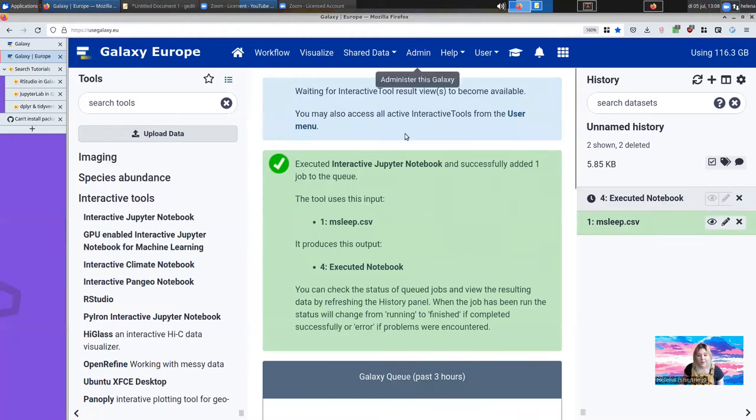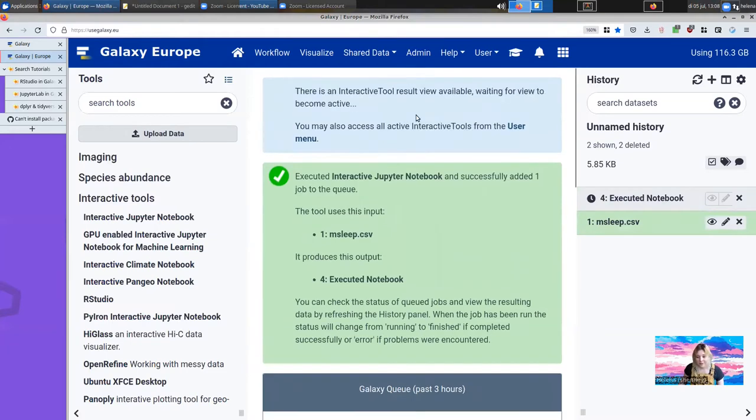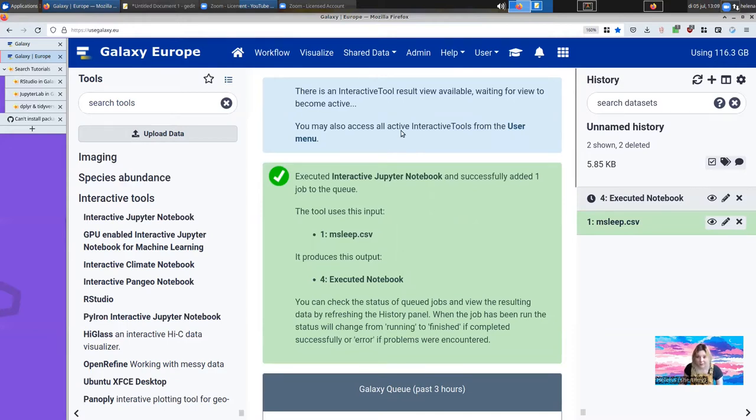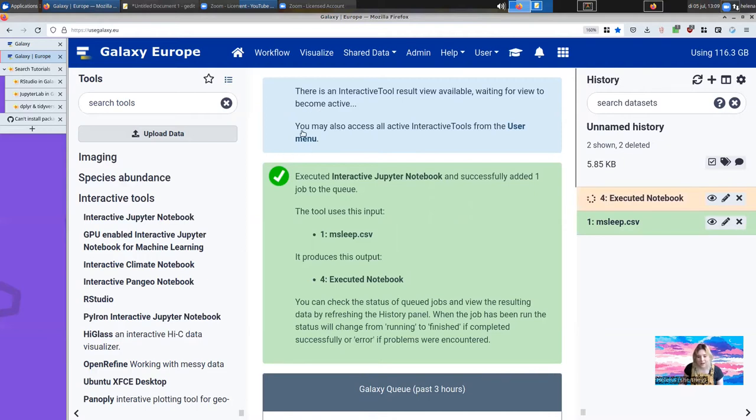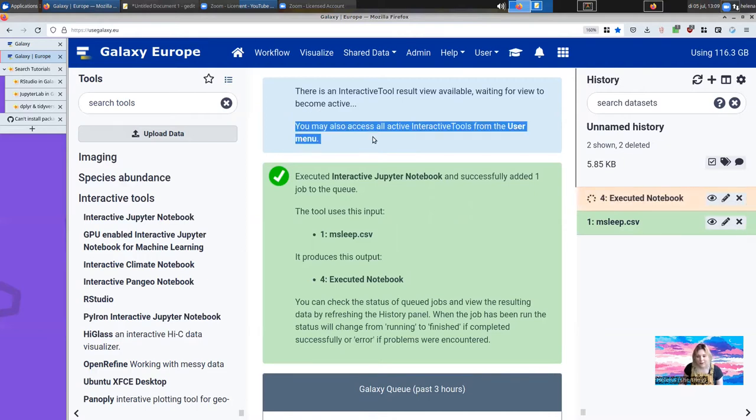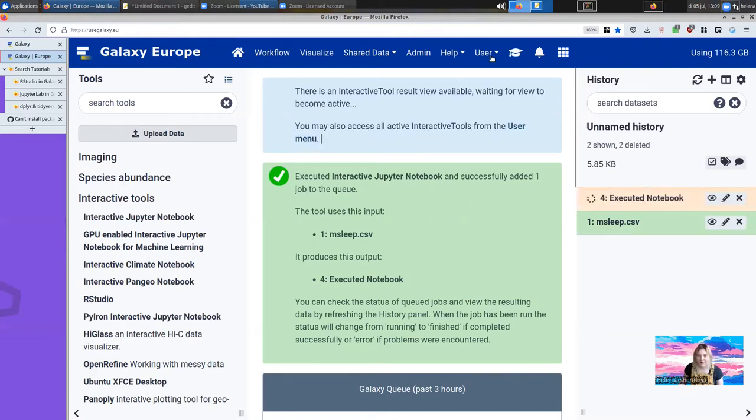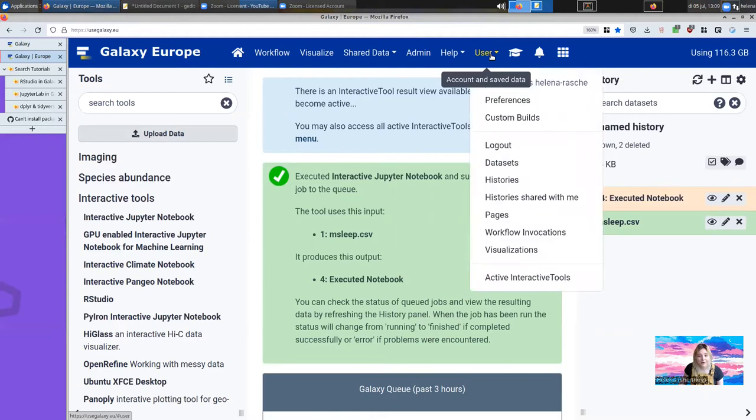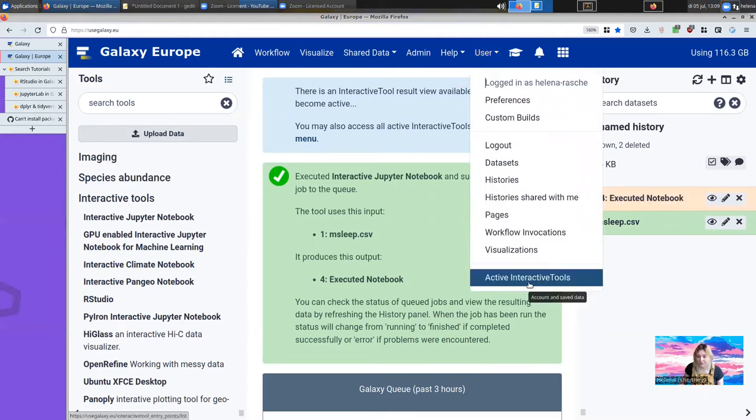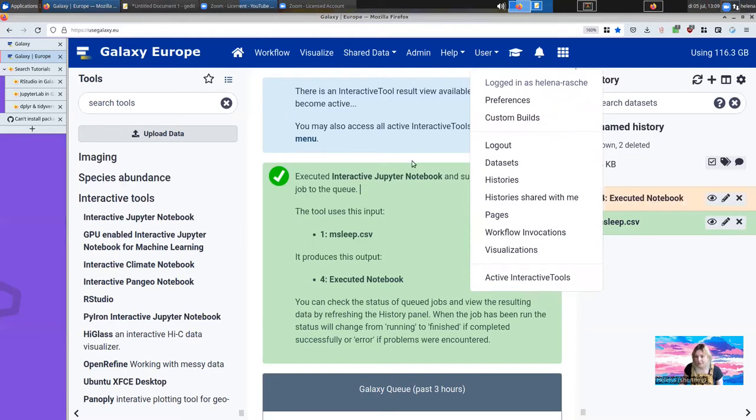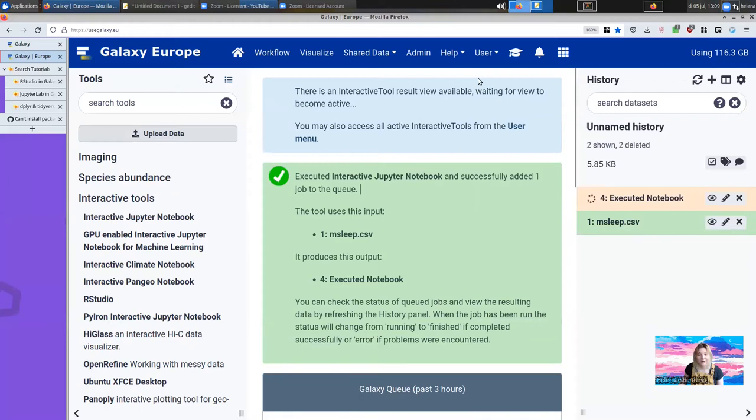You'll note that when the interactive tool launches you get this blue box at the top. It says there's an interactive tool starting. If you'd like to wait for it to be active you can do that from here. And you can also always access them from the user menu. Under the user menu you'll find them under active interactive tools. You'll get a link once it's running.